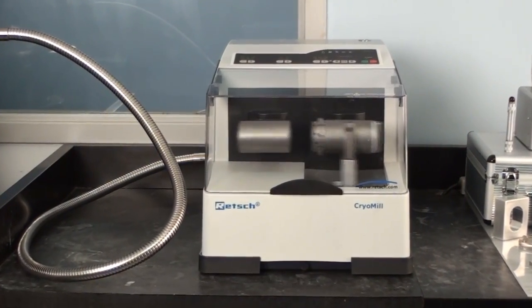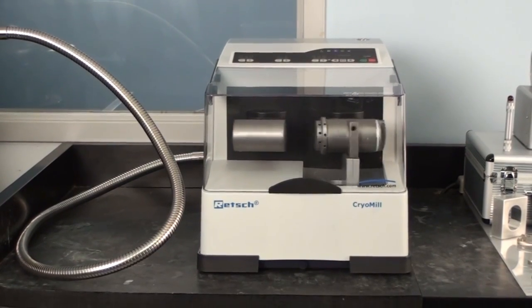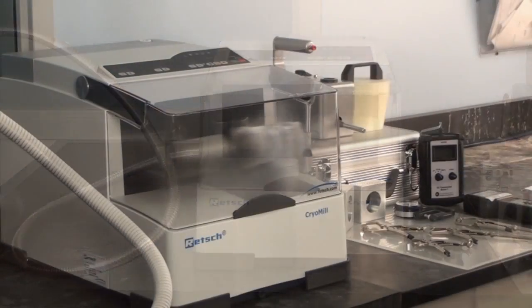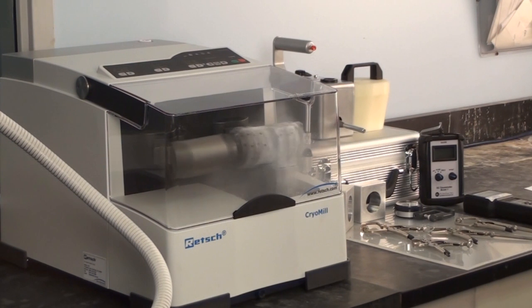He will then lock this vessel into the cryogenic mill which will have a five minute cool down period to bring your sample down to negative 196 degrees Celsius.